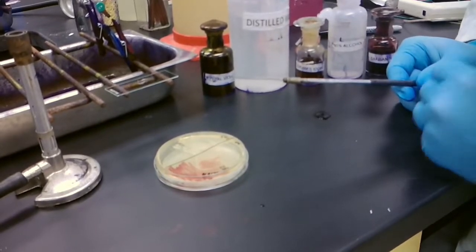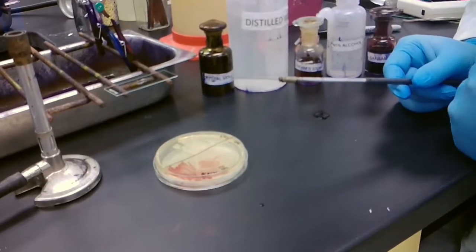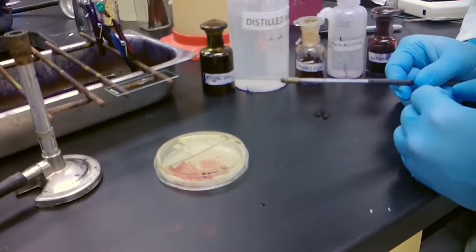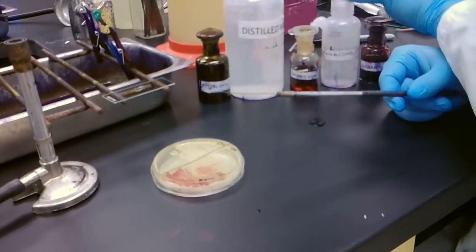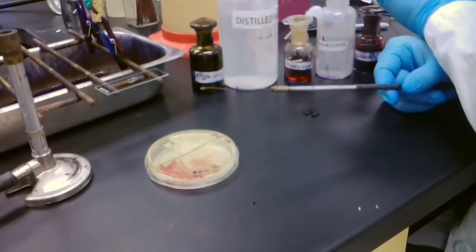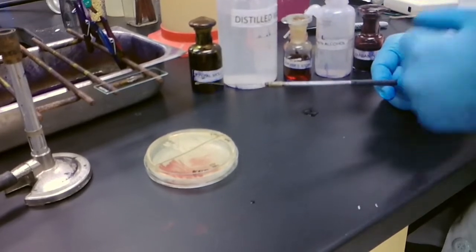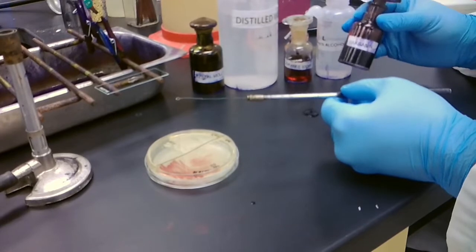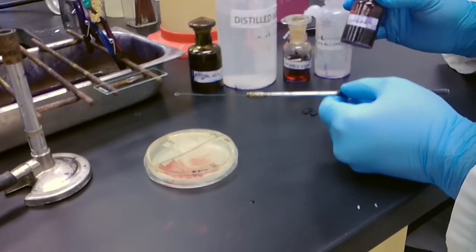If it's gram positive, it will retain our crystal violet due to a thicker peptidoglycan layer. And if it's gram negative, when we use ethanol, we will actually wash out the stain. It will degrade the outer membrane and usually wash away. And then we have our final counter stain that will stain anything that doesn't have our crystal violet.